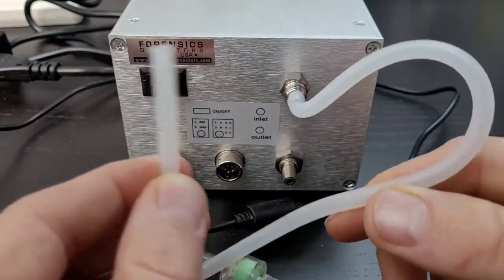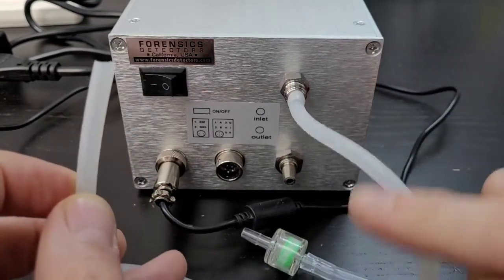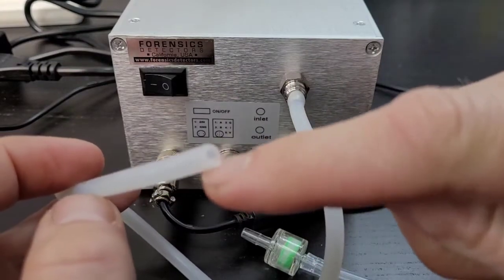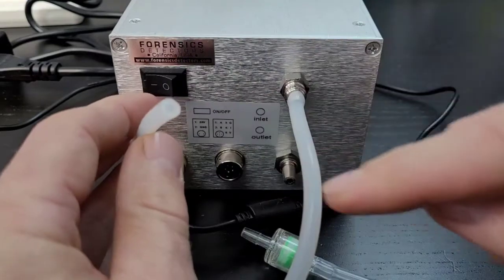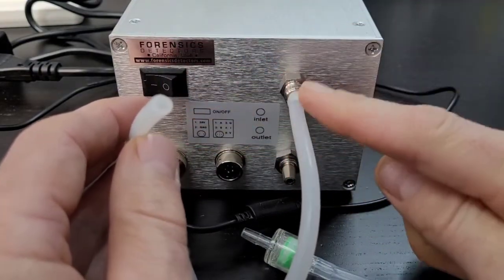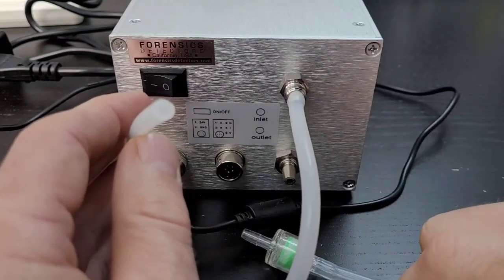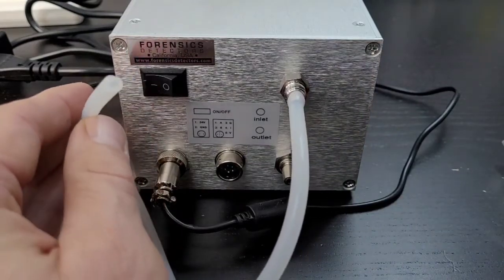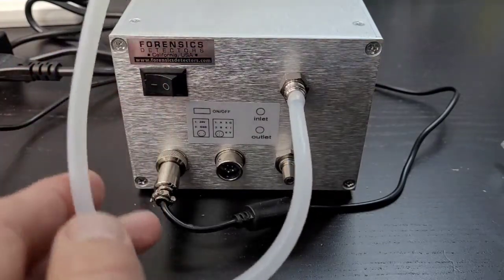But don't forget, good practice when it comes to ozone. Ozone decays, folks. So no matter what material you actually use, just transporting through this small tubing orifice decays the ozone. So at that point, you will have a different ozone measurement. Obviously, it's not going to be in the ppm. It's going to be some small percentage difference, but it could be important if you're doing very fine ppb measurements. Okay, so keep that in mind.